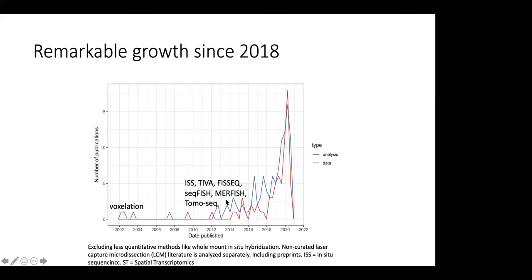in the previous talks in this session, such as seqFISH, MERFISH, and then ST, which is spatial transcriptomics with capital S and capital T, was introduced in late 2016. Since 2018 there has been a boom, and we have all these other new sorts of technologies.